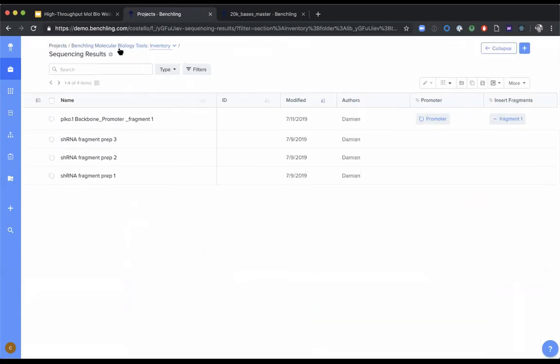Again, I can click on this expanded window to create my alignment. Now, in this case, I went and picked 3 colonies from my agar plate. I submitted them to sequencing, and now I'm aligning them to the vector that I originally designed in the bulk assembly tool. But you could imagine doing this, especially if you're picking colonies or you have a lot of AB1 files, for up to 100 sequences at once, creating an alignment very quickly.